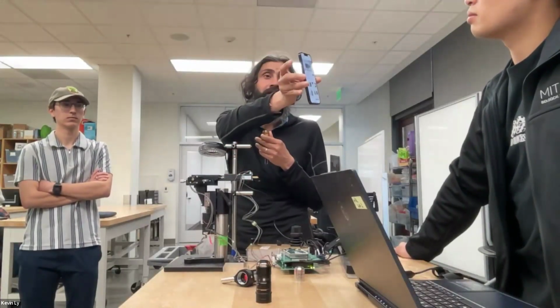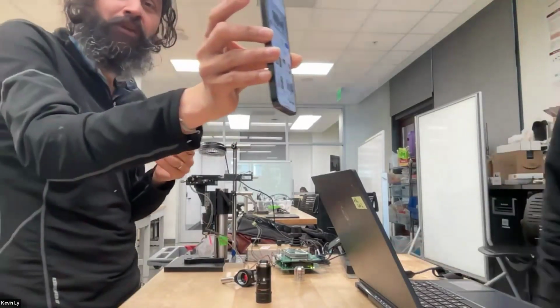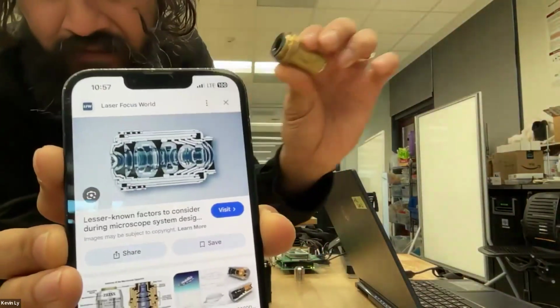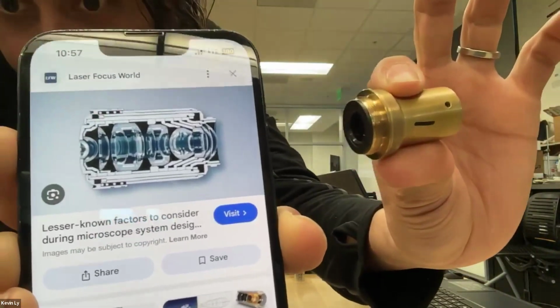And that's why I said, never cut open your objective or disassemble it, because of the magic and cost of making objectives. So this is the same object as this, by the way. So it's not something that, oh, it's very big.